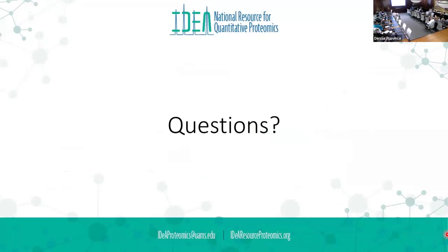Have you used that KEA3 website that Mike Washburn pointed out? I have not. Okay. I played around with it a little bit, but there's another website for kinases to try to find what's associated with the enzymes. It's the KEA3. You can find it, but I try to kind of point people that direction too.